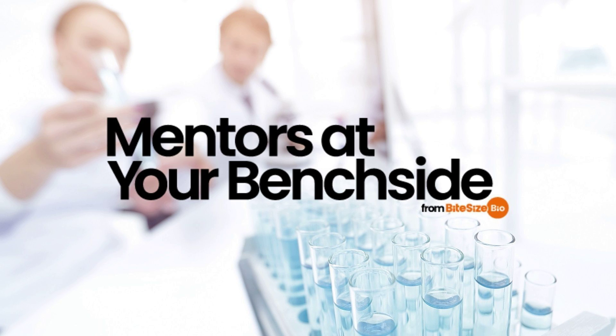This is great because it requires a genuine solution state sample, not crystals or vitrified ones. So short of in-cell imaging, NMR samples are the most representative of the native state.